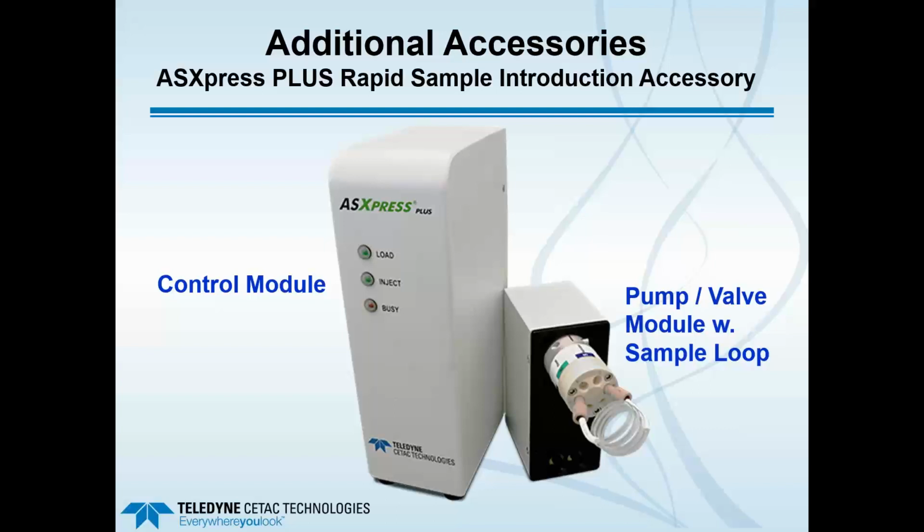The advantage here is that you avoid the longer period of pumping around the peristaltic pump. And certainly you can interface this to a standard nebulizer or to an ultrasonic. This has actually been done for the EN71 method at a user laboratory. So you can put the appropriate size loop on for your data acquisition, rapidly load it up with the vacuum pump and inject it into the nebulizer system, of course, saving time.